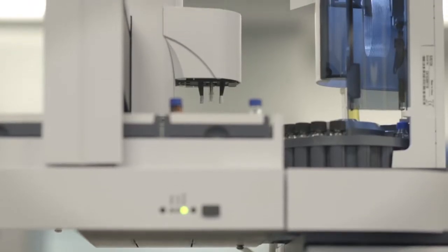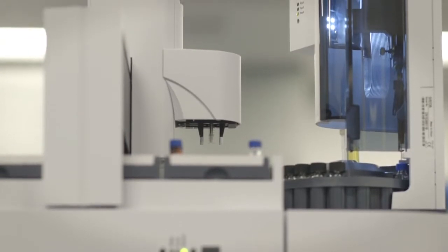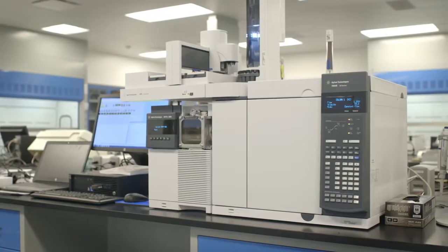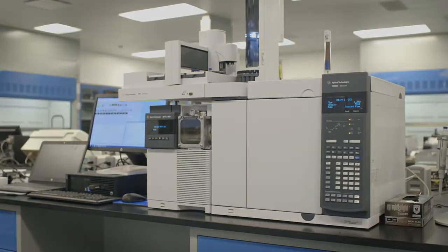And the molecules are then fragmented with electricity. Those fragments are actually measured by mass. Each molecule is specific and it fragments specifically, and so the detector can actually tell what mass, and from there tell us the molecule.